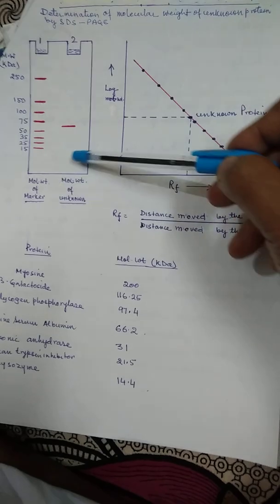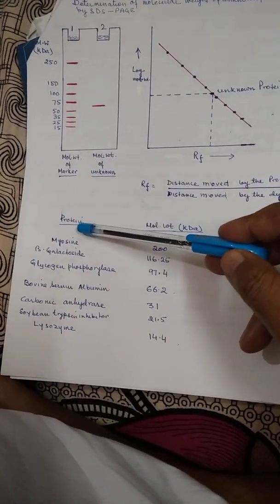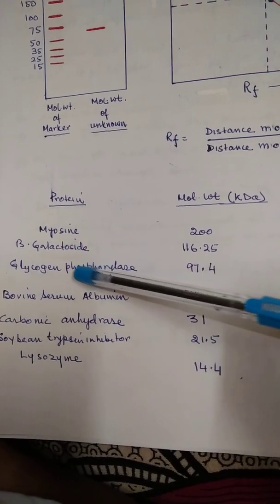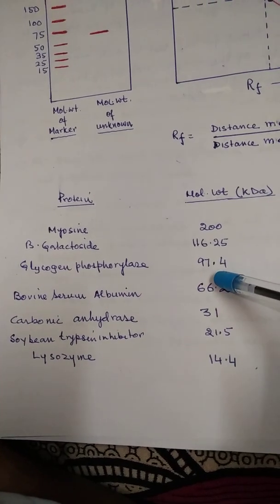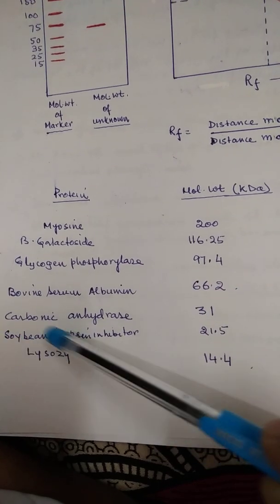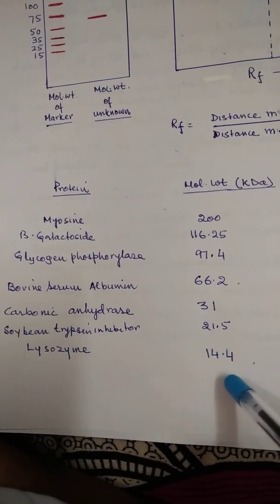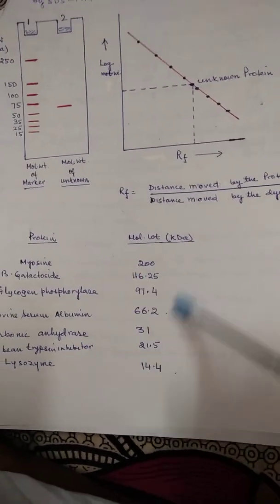So these are the molecular weights of some of the proteins: myosin 200 kilodalton, beta galactosidase 116.25 kilodalton, glycogen phosphorylase 97.4 kilodalton, bovine serum albumin 66.2, carbonic anhydrase 31 kilodalton, soybean trypsin inhibitor 21.5 kilodalton, lysozyme 14.4 kilodalton.